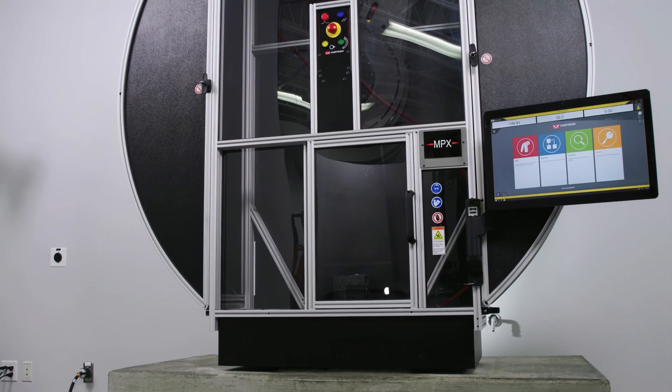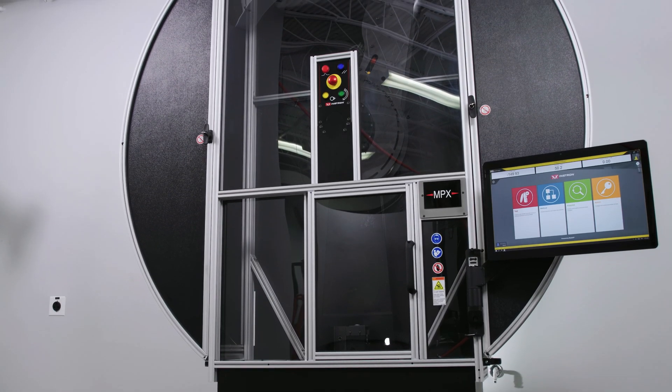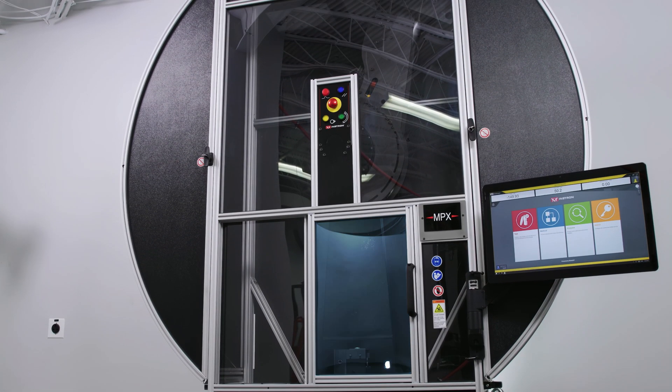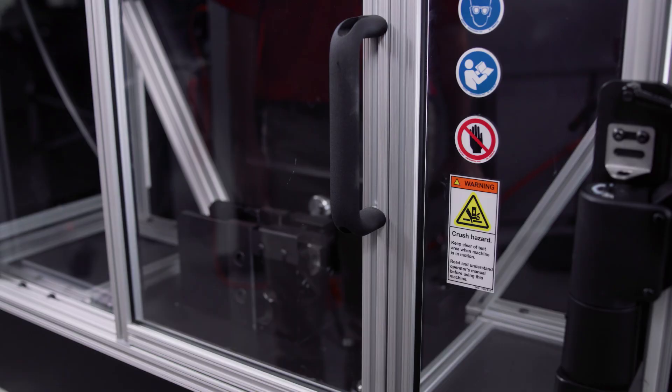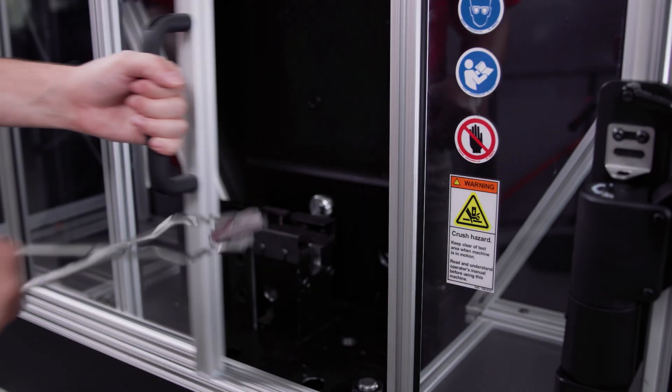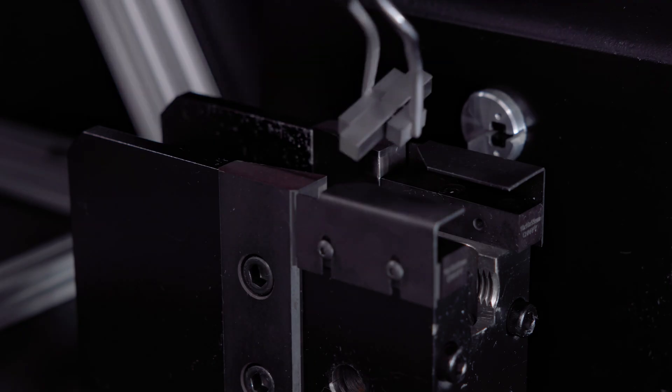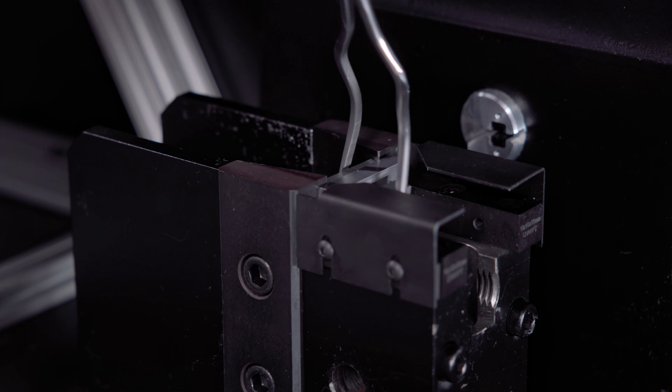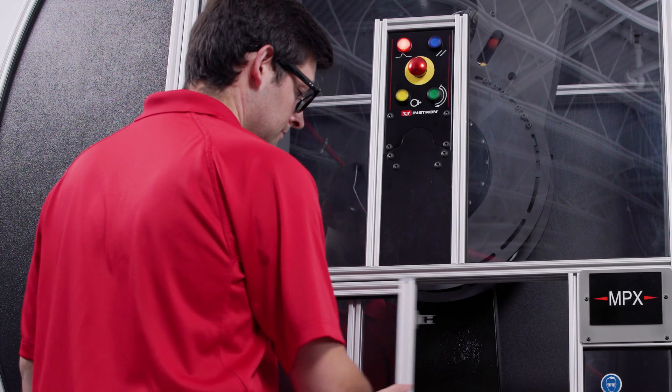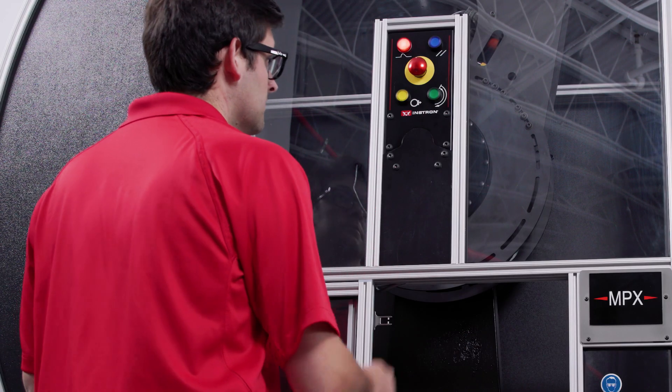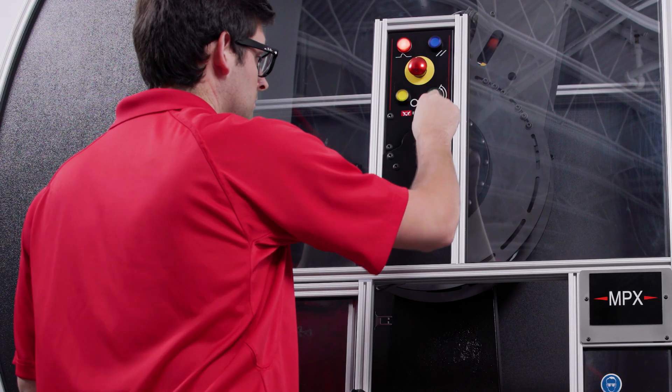On this system, there are three access points: the test space and two configurable side doors. With the hammer in its upper latch position, we can safely access our test space to load specimens and change out fixtures. The system will not allow the hammer to be released while any of these access points are open.